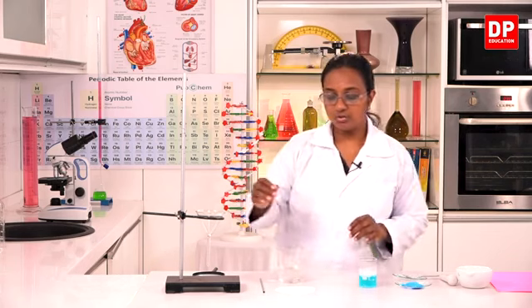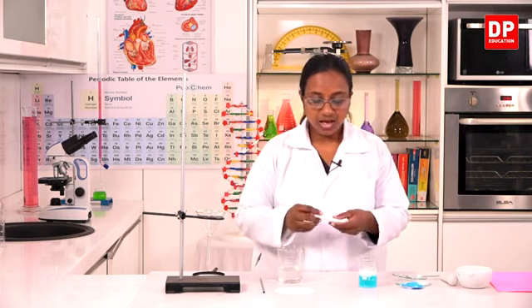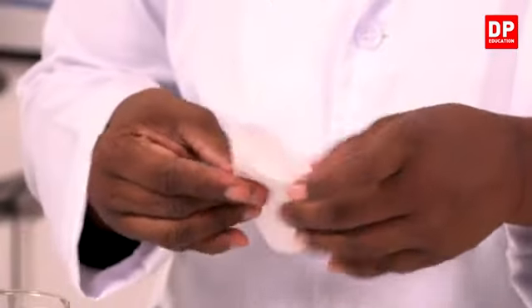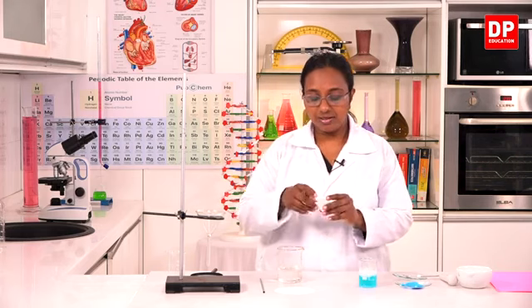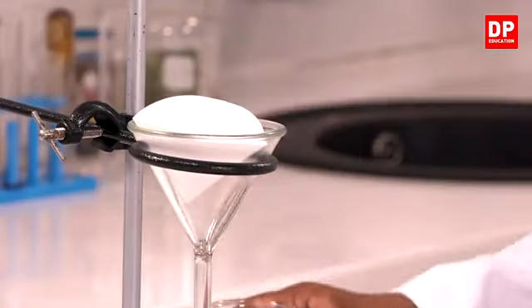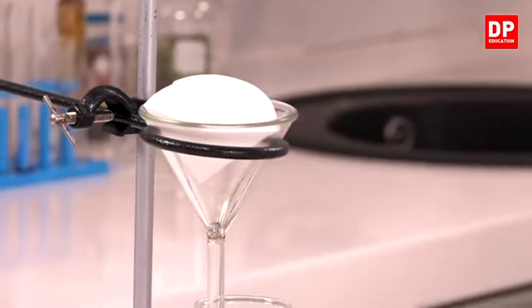Now what I will do is, this is a filter paper. I am going to fold the filter paper. I have folded the filter paper. I open it up and place it inside the funnel, and I will set a beaker under the funnel.